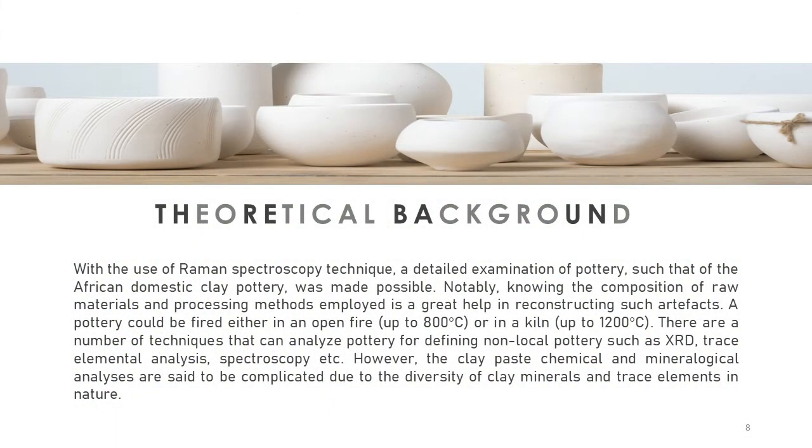Next up is a theoretical background. As per the researchers, the technique of Raman spectroscopy was used to examine a series of African domestic clay pottery shards. Such a detailed examination of pottery could give valuable information and a characterization of archaeological items by the identification of materials such as pigments, binders, and clays used in the manufacturing process.